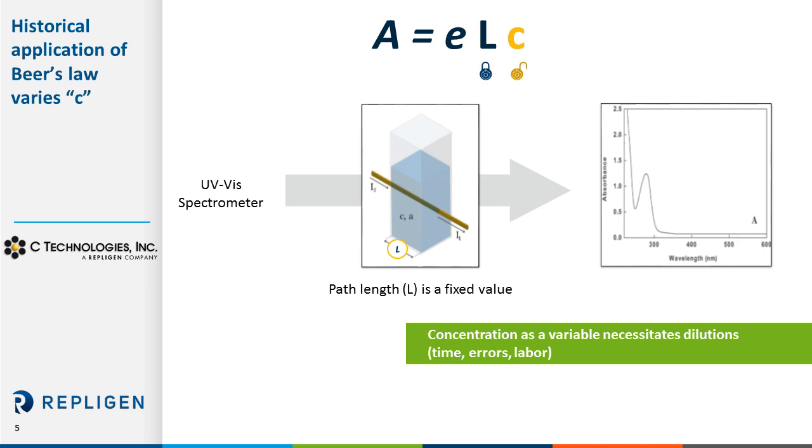The reason being, obviously, the limited detection range, the linear range of your spectrophotometer, and the fixed path length that's available to you really only provide a limited window for linearity based on that sample. So if your sample happens to fit within the path length range of the instrument, then in most chances it might work for you. But as we know, in most cases, especially with high concentration samples, it does not.